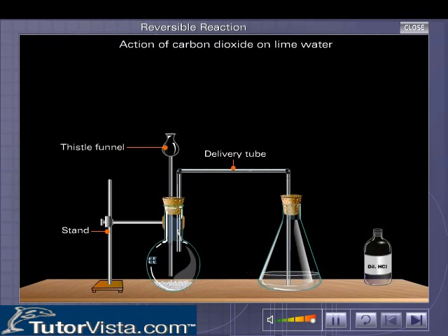Take some lime water in a conical flask. Take some marble chips in a round bottom flask. Arrange the apparatus for the preparation of carbon dioxide gas as shown.